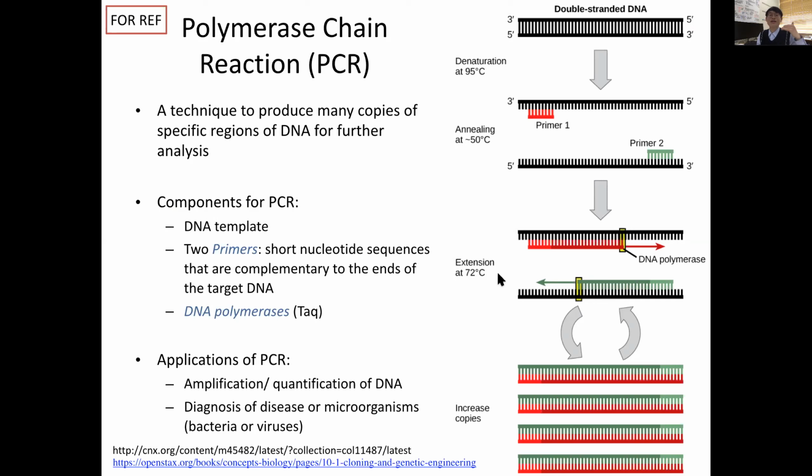And in fact, even in very hot places, there are still life forms around. We found the enzyme working at this temperature, called Taq polymerase. Because of this finding and use, we can actually run this DNA polymerization, and you keep this cycle over and over, and we increase the copies almost exponentially.